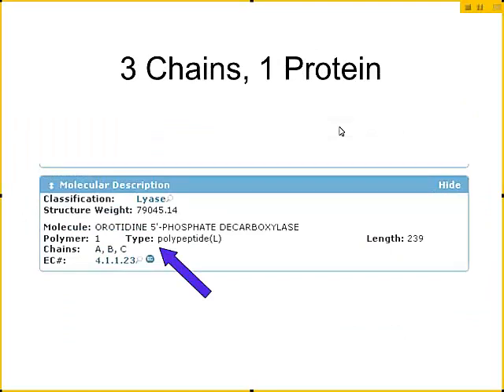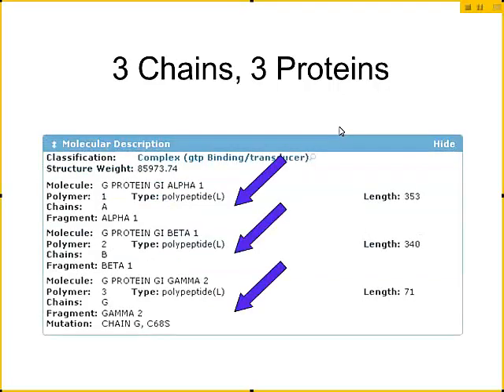One way you can look at the biological unit is that the chain names being put up here are chain names for the asymmetric unit. You can just look right here, and this is an example where we have a single polymer type chain, but we have 3 copies of that molecule. So we have a homotrimer in our asymmetric unit. So it's 3 chains, 1 protein.